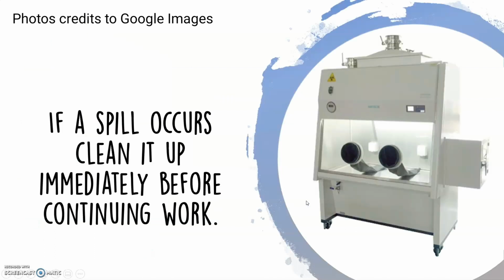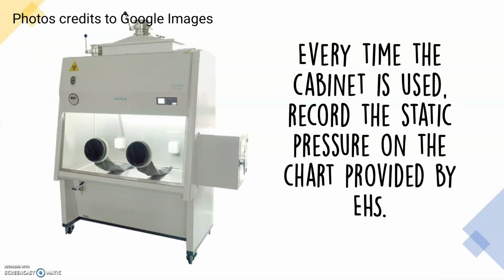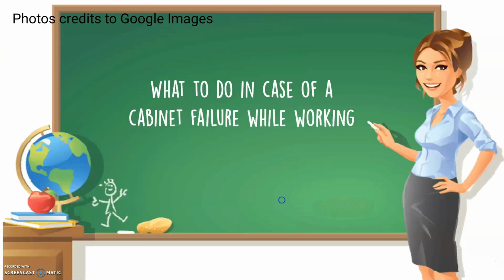If a spill occurs, clean it up immediately before continuing work. Do not use an open flame in a biosafety cabinet. Every time the cabinet is used, record the static pressure on the chart provided by EHS.